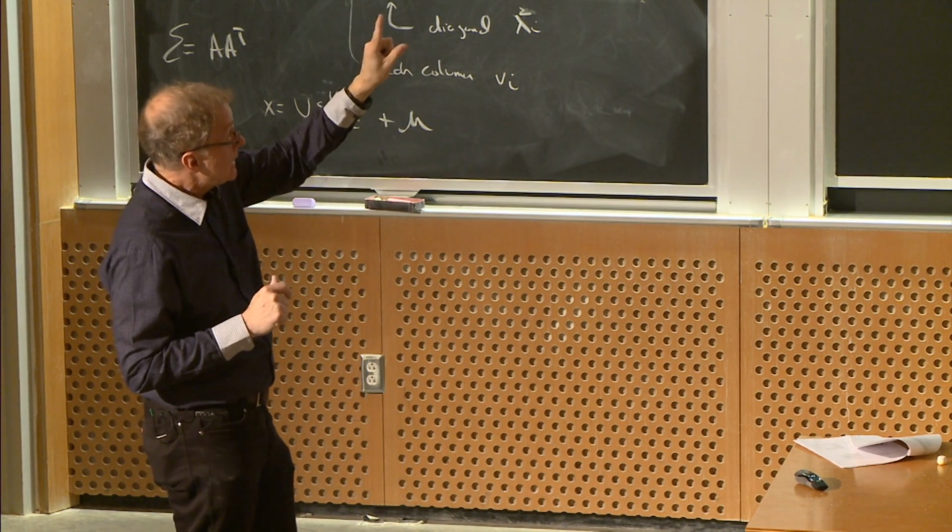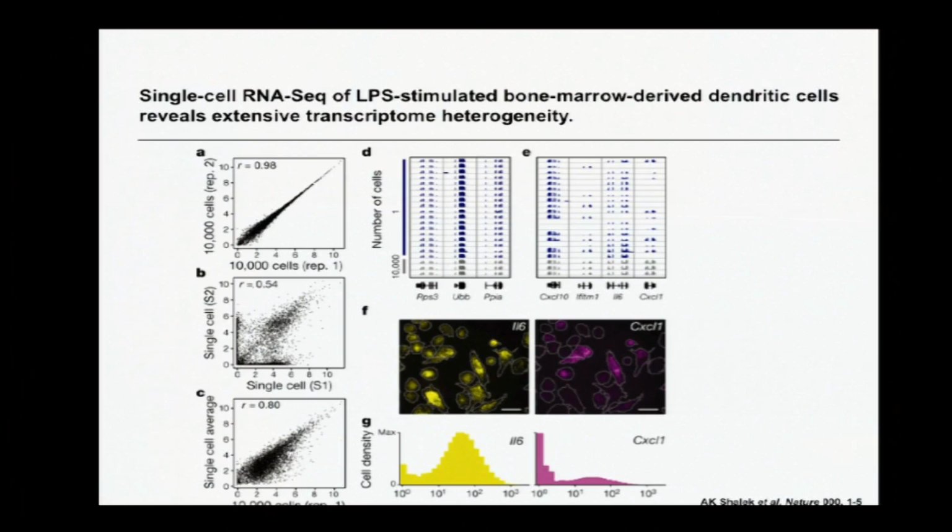And so panel D shows isoforms that are the same across each one of the single cells being profiled, which is the solid bar at the top. And the bottom couple of rows in figure D are the 10,000 cell experiment average. But panel E is perhaps the most interesting, which is that the isoforms for those 4 genes are being differentially expressed in different individual cells.